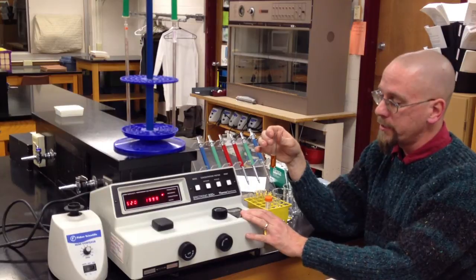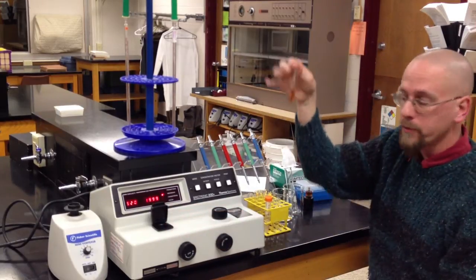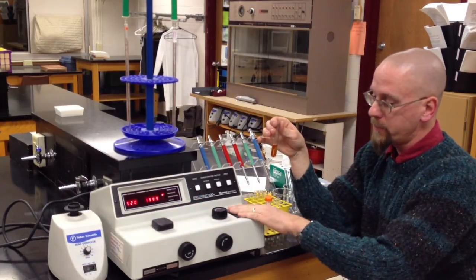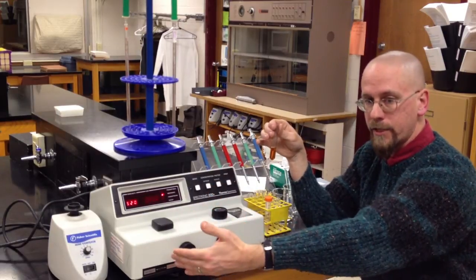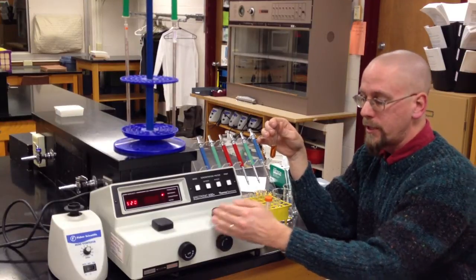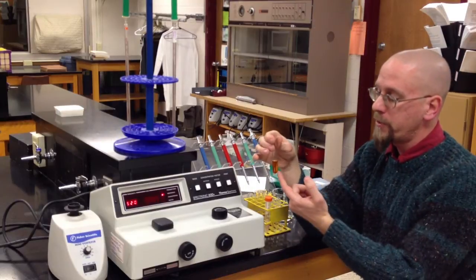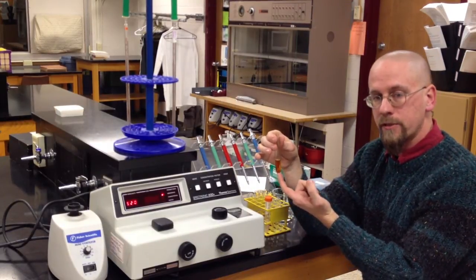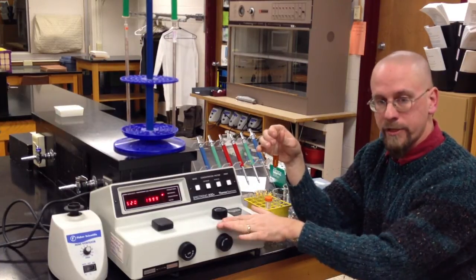What this instrument does is you have a sample chamber in which you put a liquid sample and it measures from a lamp on one side shining through the sample to a detector on the other. It knows how much light leaves the source versus how much light makes it to the detector. So in effect, it's measuring how much light gets absorbed or transmitted by this solution. So if the solution changes color to darker or lighter, we can measure it with this.